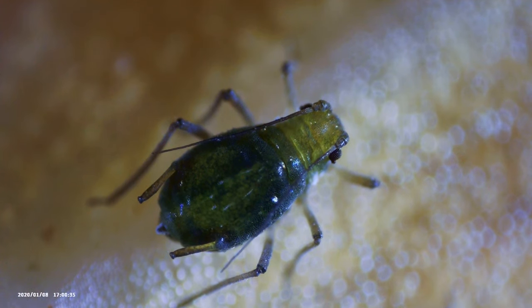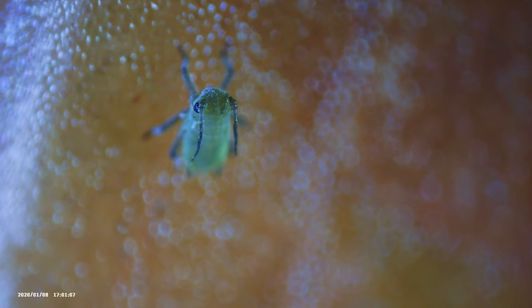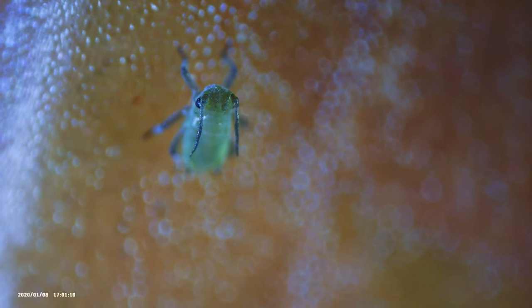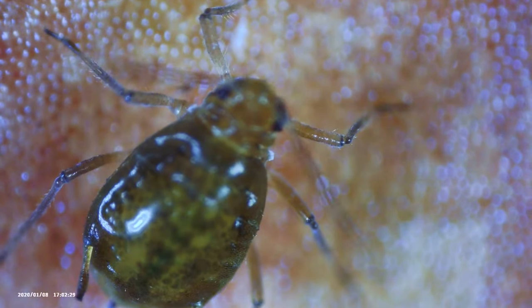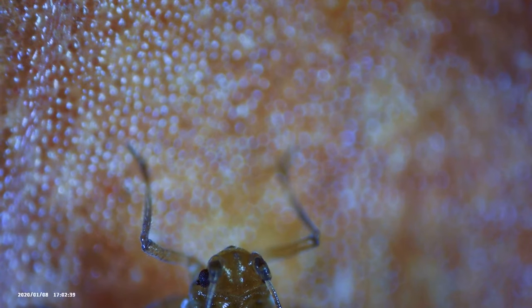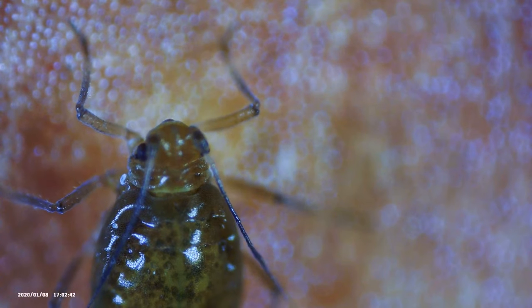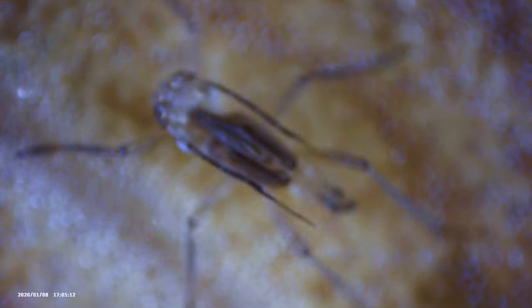Next up we're going to talk about aphids. These are probably pretty common mostly outdoors — I don't think a lot of people run into these inside, because they only eat certain plants that are kind of fleshy and easy to chomp on. They spread very fast but only to certain plants. A lot of people also think these are thrips; I see posts where people say their plant has thrips because there are 40 of these on the underside of their leaves. But thrips are a lot smaller, more elongated, and not quite as big and round and chunky as aphids.